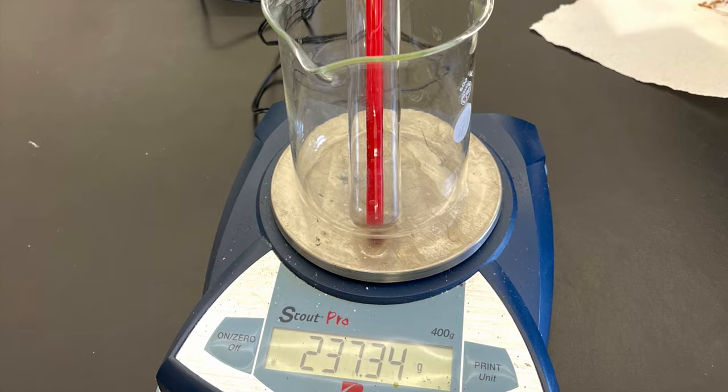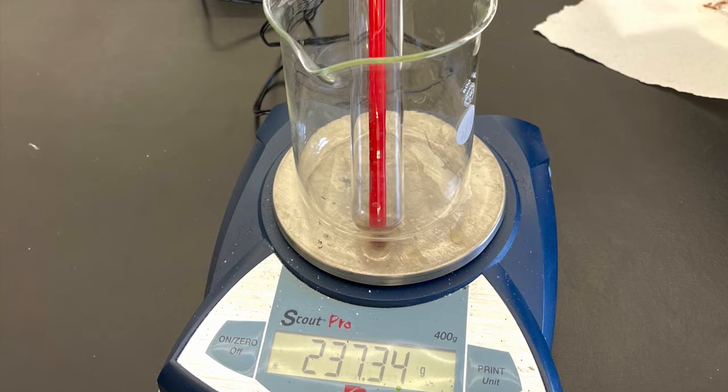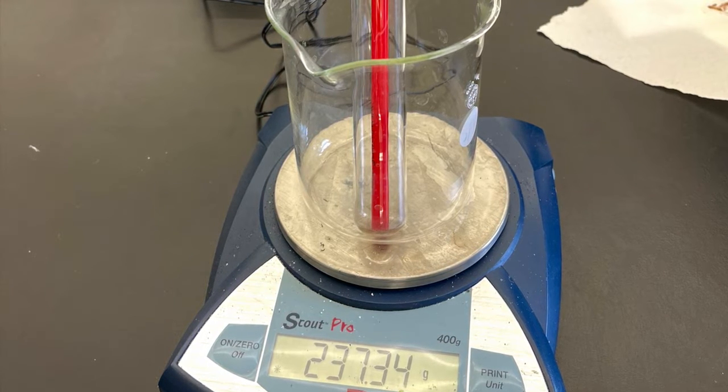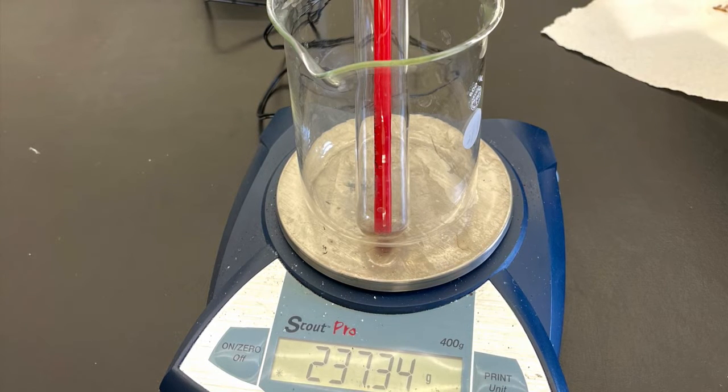The purpose of this experiment is to measure the solubility of a salt in water over a range of temperatures, to then represent the salt solubility measurements graphically, to understand the factors that affect the solubility of a salt, and to use the proper units for solubility.